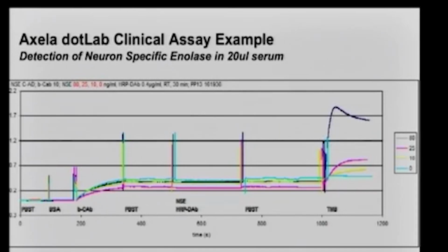And in this case, Dr. So is this a marker which indicates the traumatic injury? That's correct, yes. I'm not an expert on the subject, but Dr. Berger was using this primarily to look at markers in babies. When babies have shaken baby syndrome, there are issues about whether the baby has been shaken. In this case, being able to use only 20 microliters is very important because you cannot get too much blood from babies. Right.